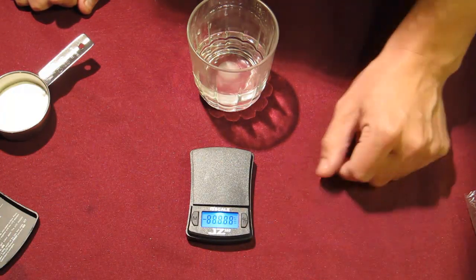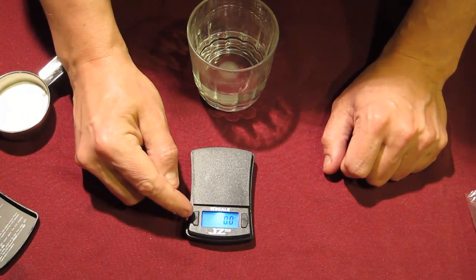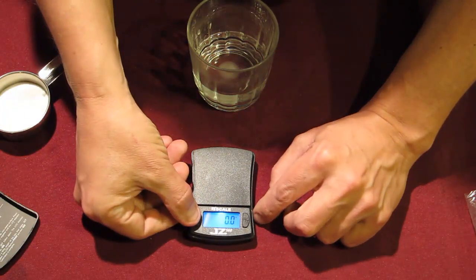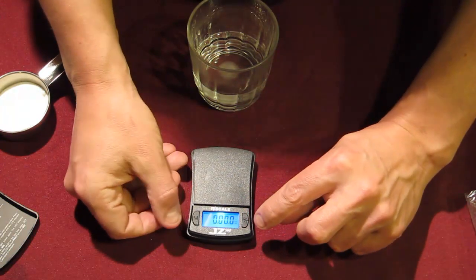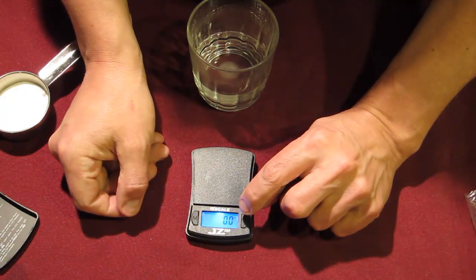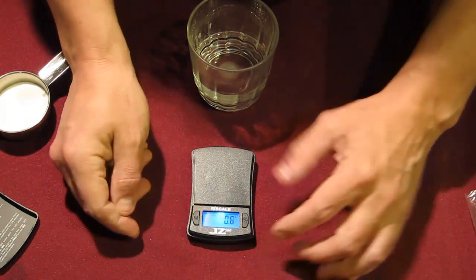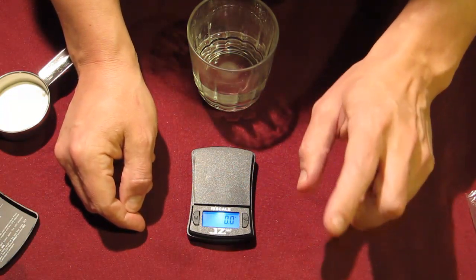One other thing you might want to keep in mind: should you happen to hit the button on the other side of the scale — the button labeled M — that button is used to change the different measuring units. By default it starts in grams, and you always want to use grams. Each time you hit this button it will change: it goes from grams to ounces and a few other measurement values that you don't use for DCA. Always make sure you see the small 'g' in the top right of the display to know that you're measuring grams. If you accidentally hit this button, just keep hitting it and it will cycle through until you get back to grams. Make sure it's always in grams — it's very important, or you will not be getting the proper amount of DCA.